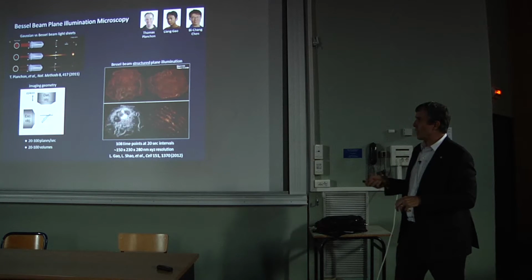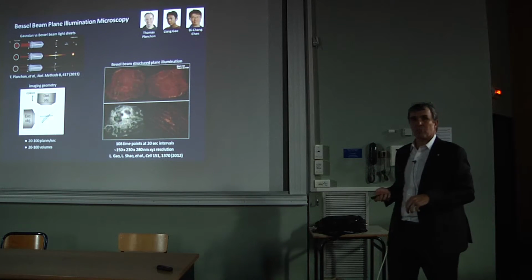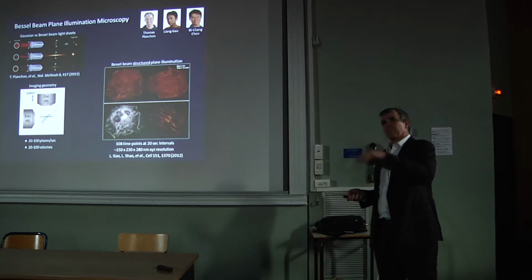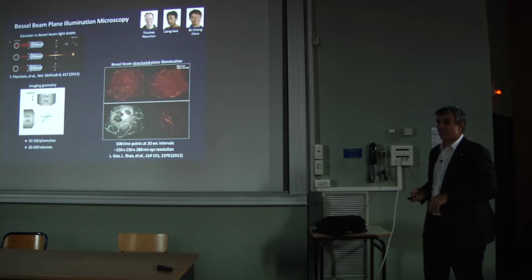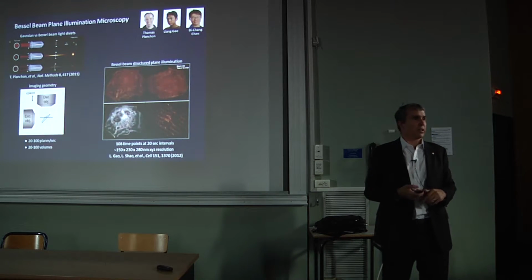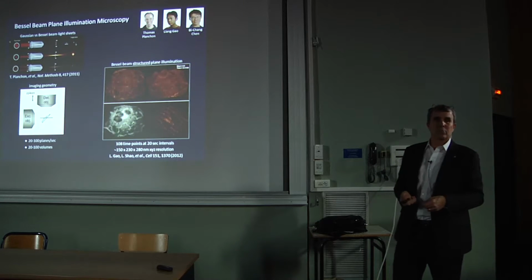And so now it's a pencil of light that you sweep in and out of the screen while you integrate on the camera. Then you step to the next plane and the next, and you generate your image. That sounds like it might be slow, but in our current microscopes, we go up to 1,000 planes a second or several volumes a second.